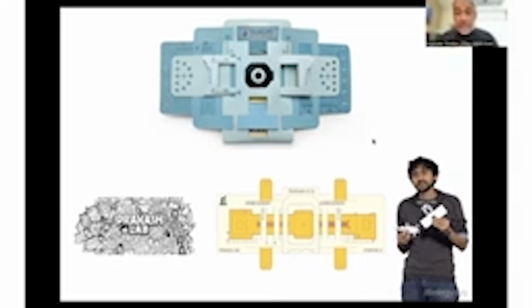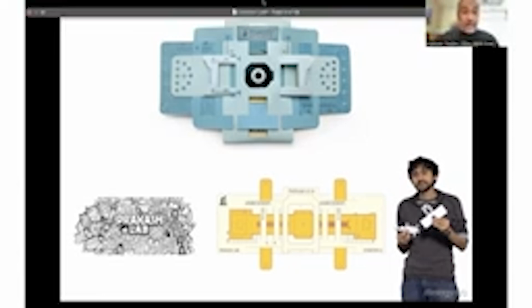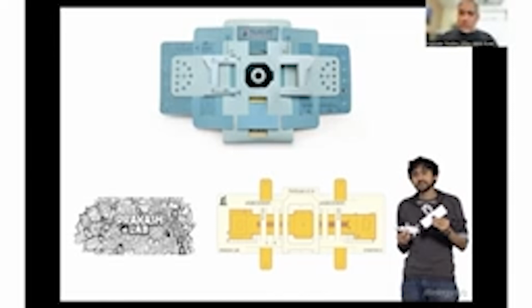So if you've never handled or looked at a Foldscope, go look it up, right? Foldscope is available to buy in India as well. There is a company called Goody Labs, right, which sells Foldscope in India. And it comes in a small pencil box, and it's a really remarkable thing to see, right? And what you realize is there is an immense power to be able to look at things at a magnification that allows you to see that they exist, right?